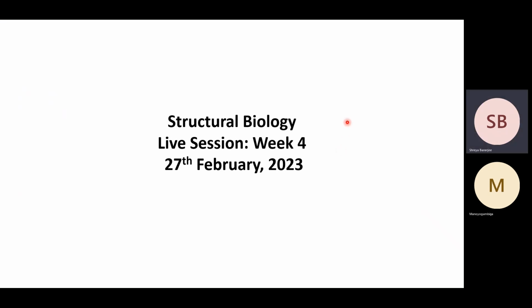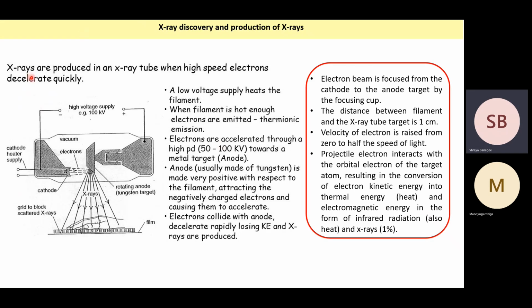Right. So today is the fourth live session of the course Structural Biology, and we will learn more about X-ray crystallography. So first, we will talk about how the X-rays are produced.